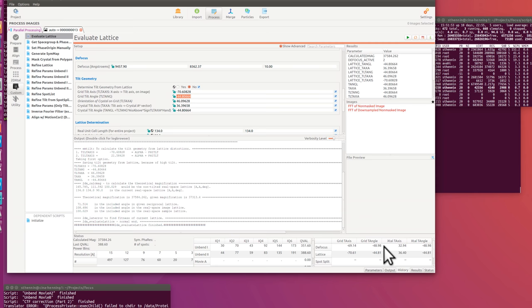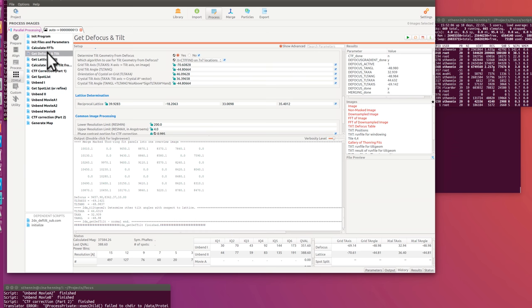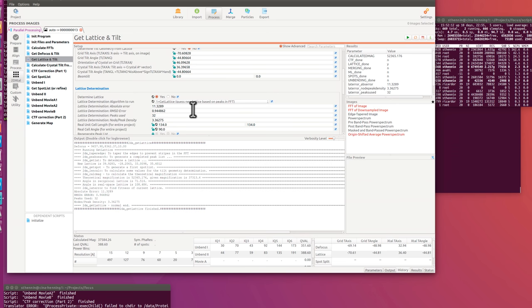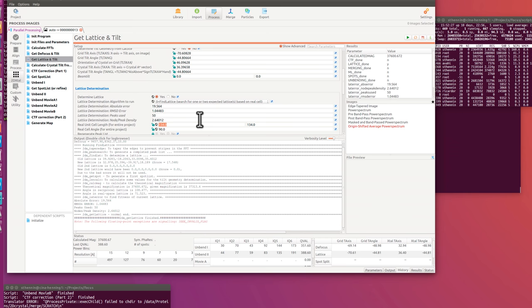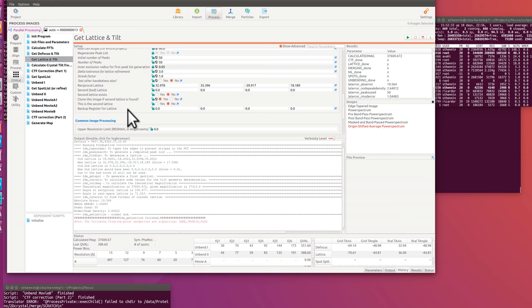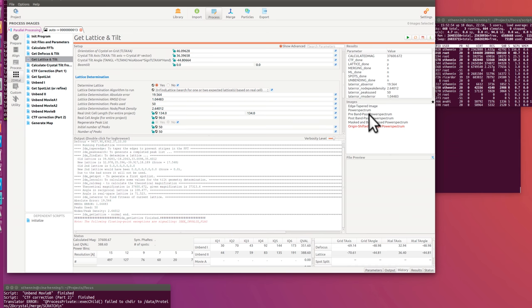Okay. So now we would know the absolute lattice, and we could go here to find lattice, which is then more reliable. Let me just try this out. Because now we have 134 and 134 as lattice vectors, and this find lattice script can now find more than one lattice. So where is that? It only found one. Okay, sometimes it finds two, not on this one.